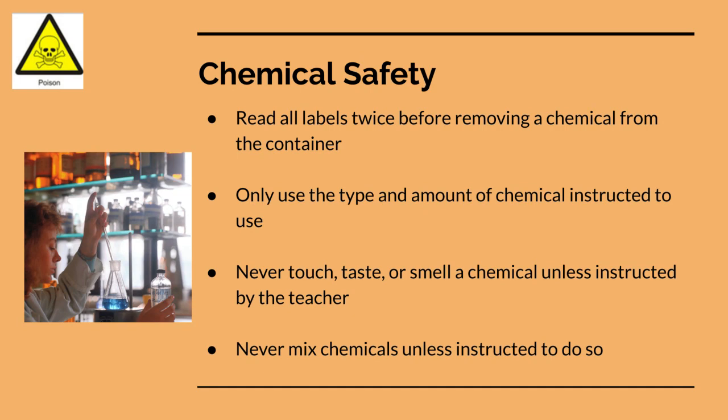Same idea. Only use the type and amount of chemical instructed. Never touch, taste, or smell chemicals unless instructed by the teacher. Okay, and pretty much 99% of the time, you should not be tasting or really directly smelling. You can obviously waft. Some of you should already know what wafting is. If not, there's a video we're going to watch that shows that, and I'll probably do a demo of what that means later on. And then never mix any chemicals unless instructed to do so.